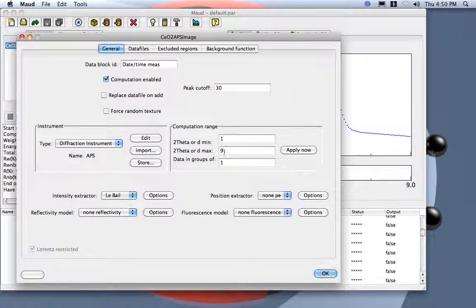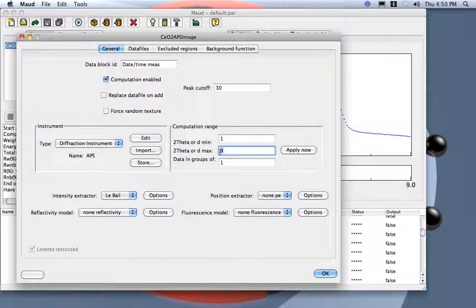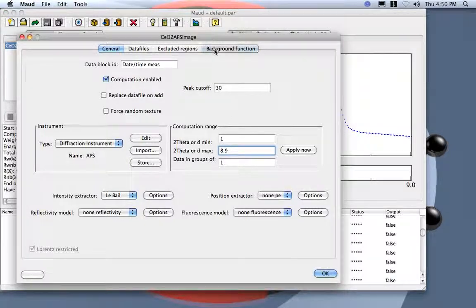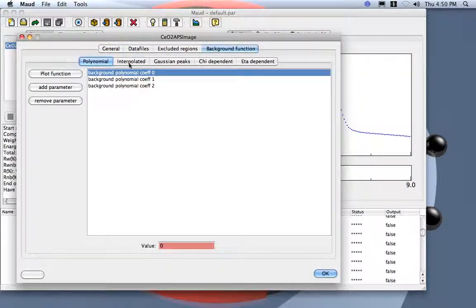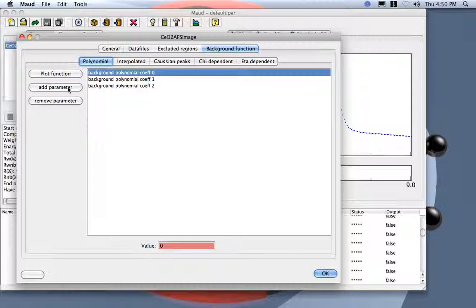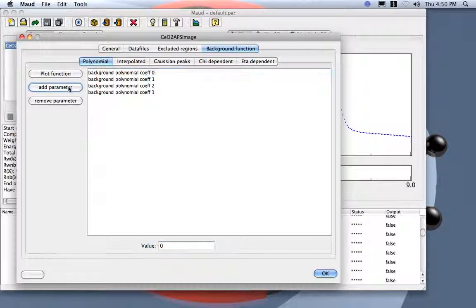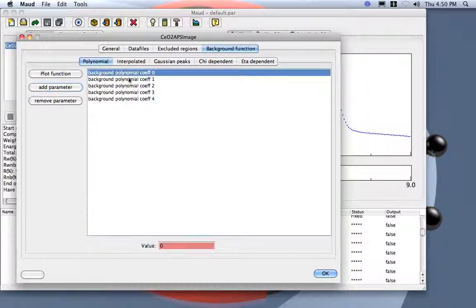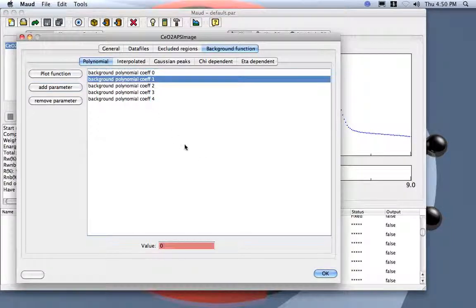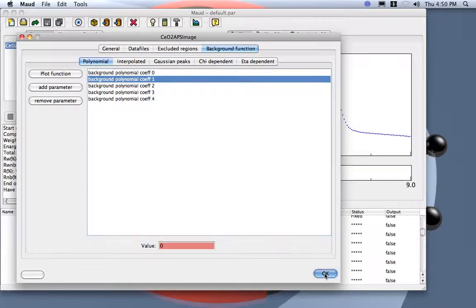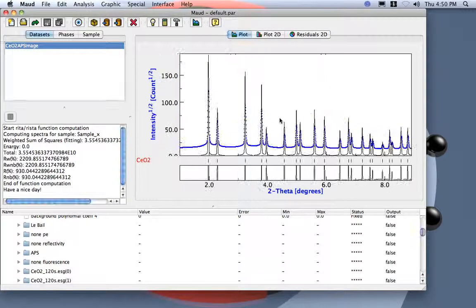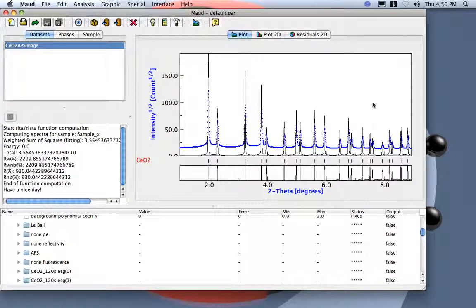Here I put 8.9 and I go to the background function and I add to the polynomial background two more parameters to get a 4 degree polynomial. Now I can start to refine.